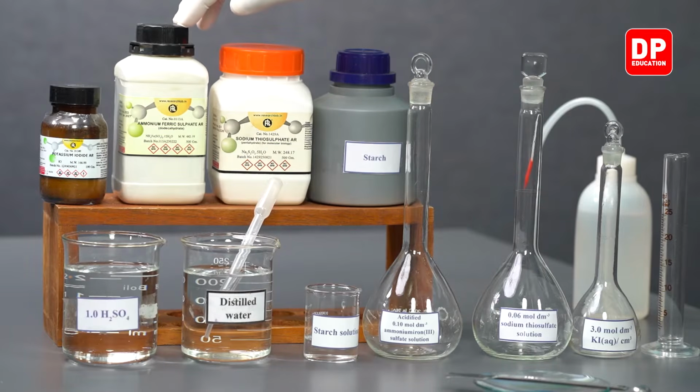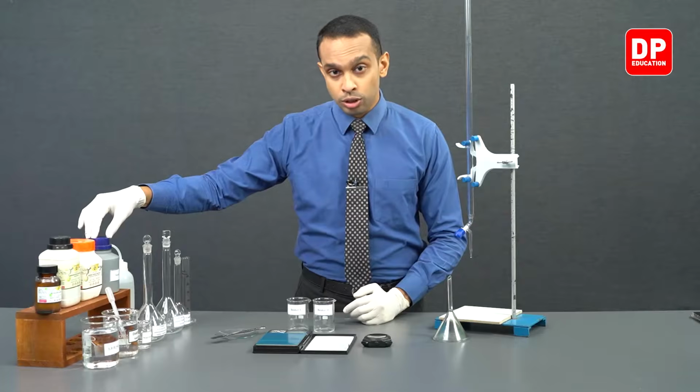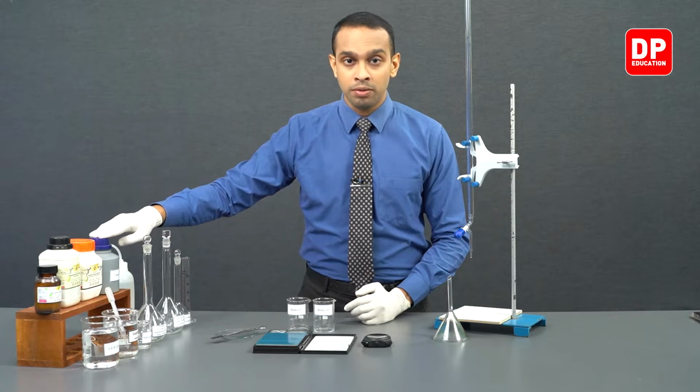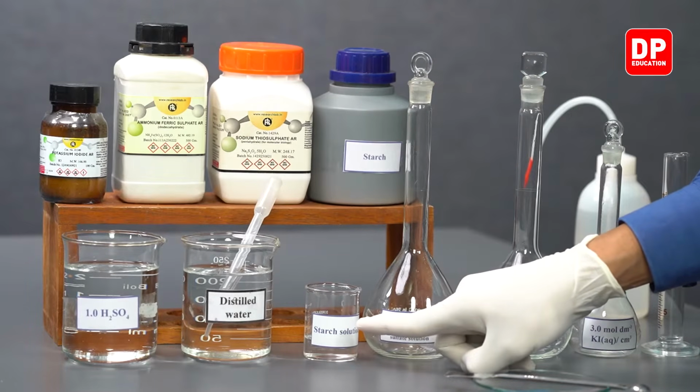We'll be using ammonium ferric sulfate, or you may also see it written as ammonium iron sulfate, sodium thiosulfate, and starch. Using the starch, we'll be preparing a starch solution. We have a starch solution prepared here.